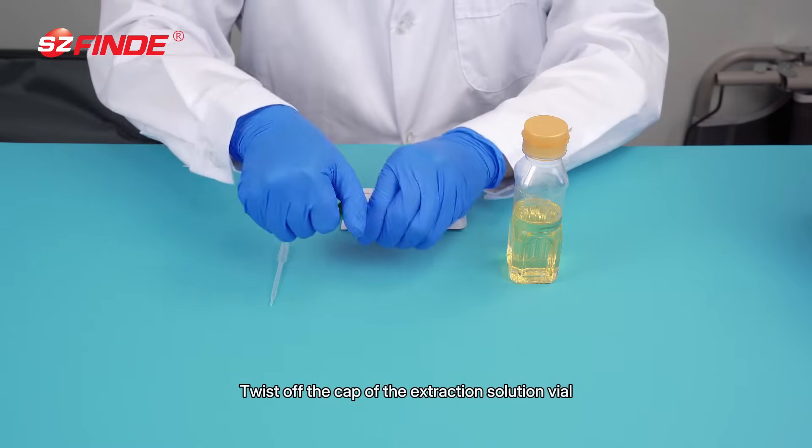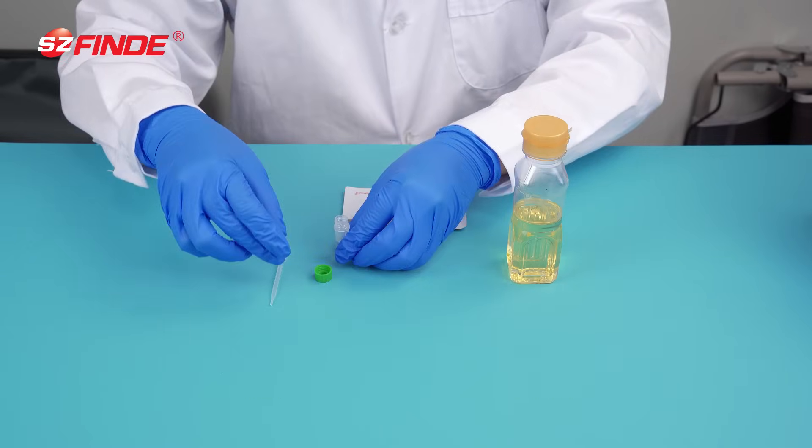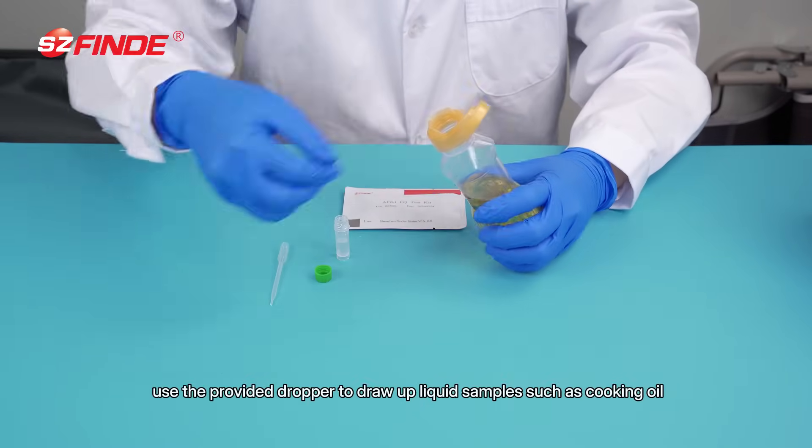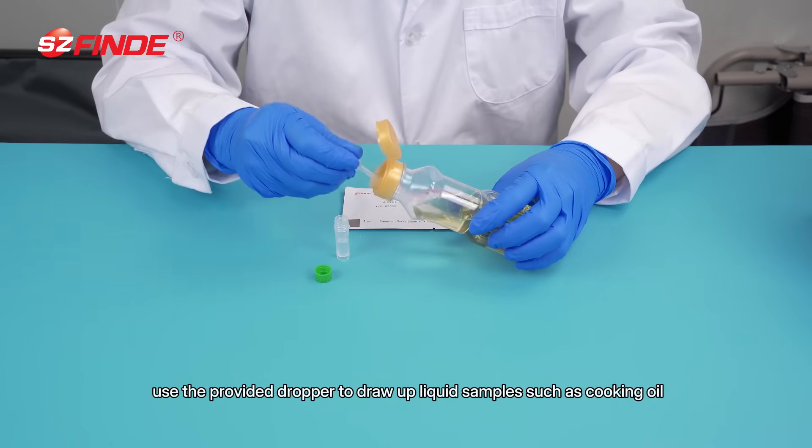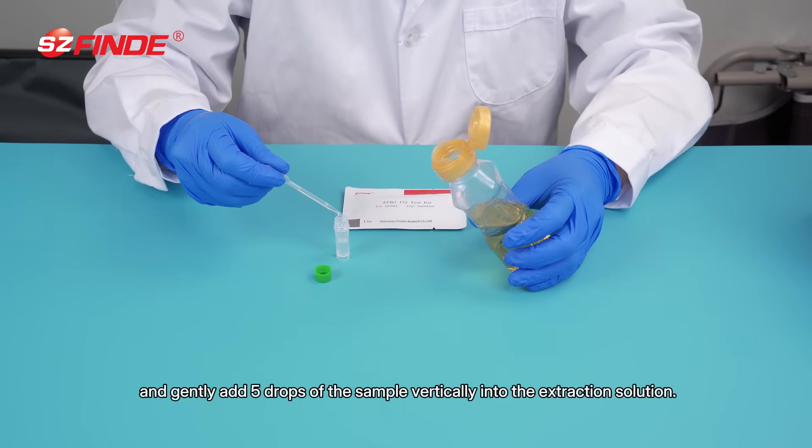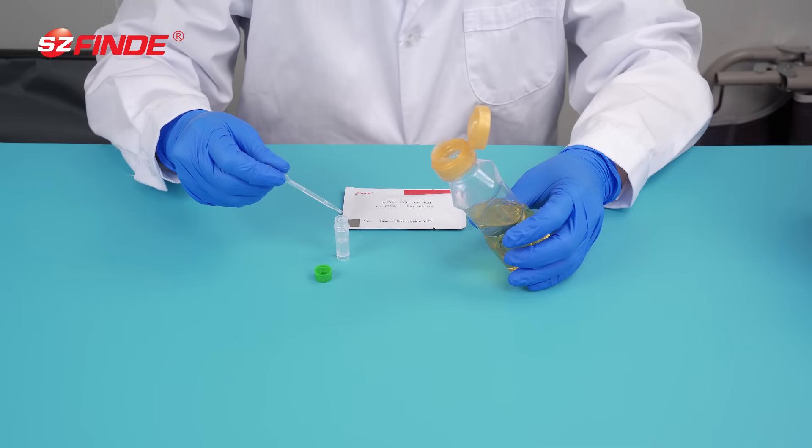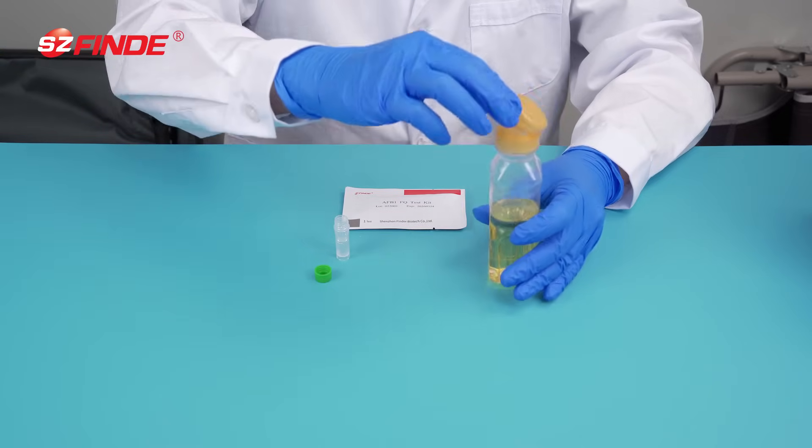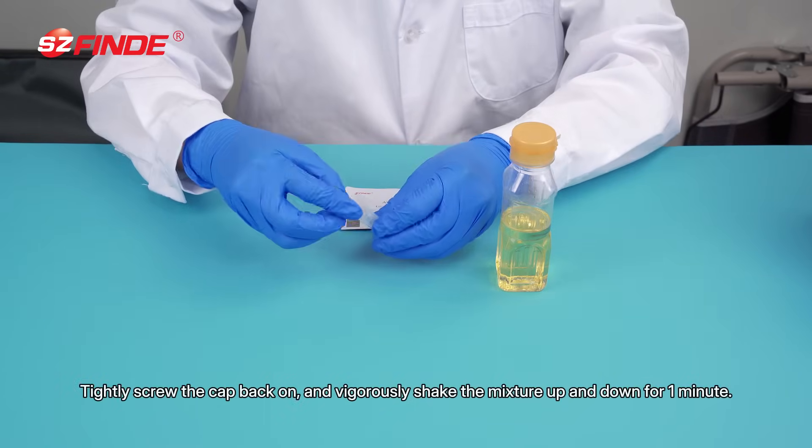Twist off the cap of the extraction solution vial. Use the provided dropper to draw up liquid samples such as cooking oil and gently add five drops of the sample vertically into the extraction solution. Tightly screw the cap back on.